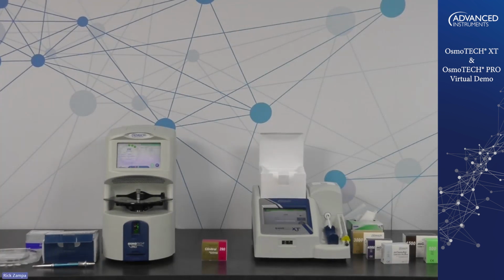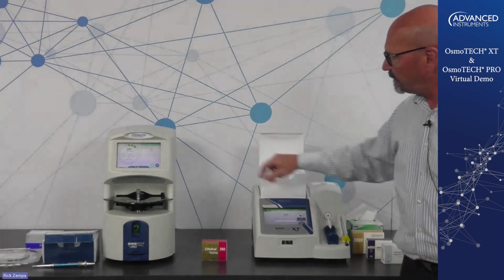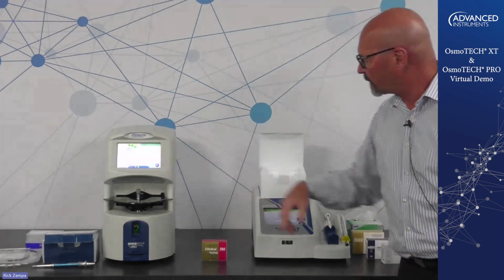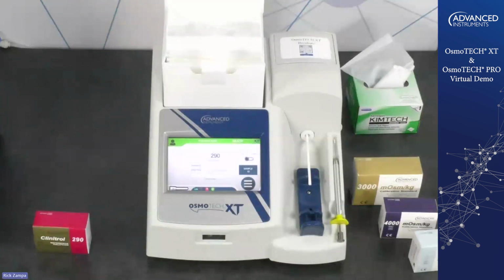Rick, over to you. Okay, you should be able to see the instruments now, I hope. Yes, we can. Okay, perfect. I will move around to the instrumentation and we will get started. As Shweta said, we have the OsmoTECH XT on this side, and we have the OsmoTECH Pro over here. We're going to start out on the OsmoTECH XT. So I'm going to switch cameras here, and it should zoom in on the OsmoTECH XT.